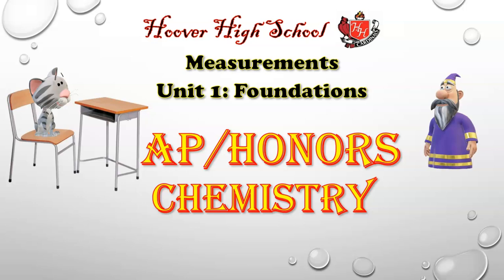Okay, chemistry. This is a brief introduction to measurements that we'll do in the lab using some of the equipment that we will be using in the lab, and how you read the equipment. What's the proper number of digits that you read your measurement?